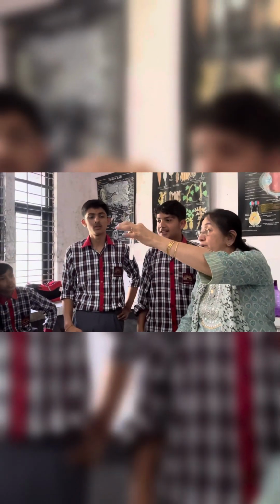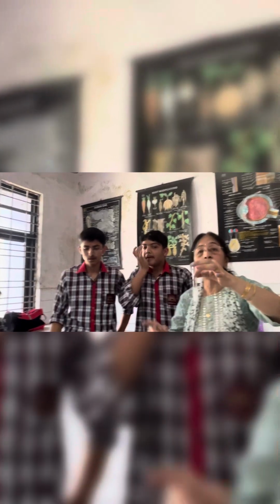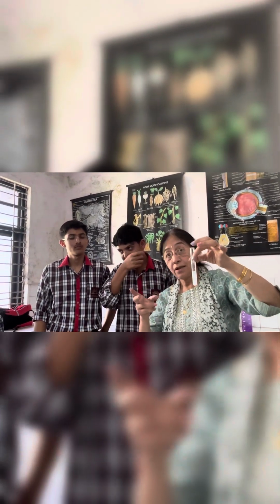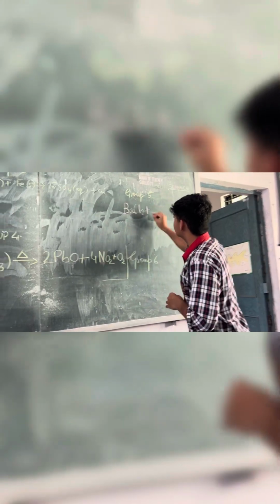White precipitate of barium sulfate. Two solutions, barium chloride and sodium sulfate, combine, they exchange ions and they form a solid substance which you can see is white in color. It is barium sulfate, and the upper layer is sodium chloride.